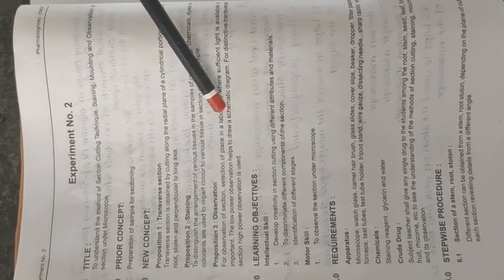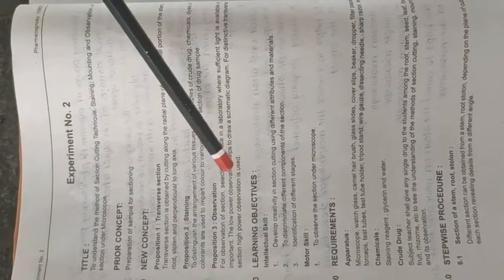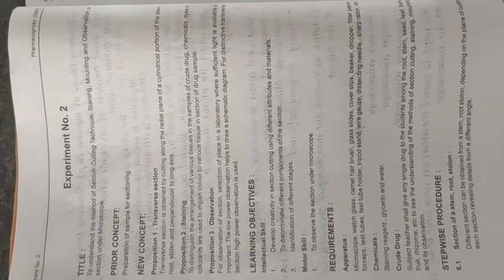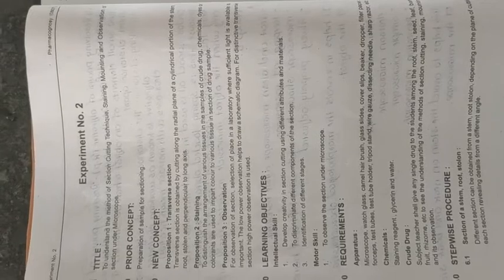Next is your observation. You can observe this slide under the microscope in a laboratory where sufficient light is available, which is important. Low power observation helps to draw a schematic diagram for distinguishing the transverse section. High power observation is to be used, where you observe your slide with proper light. In this way you can do your observation. These three things are all very important for your experiment.